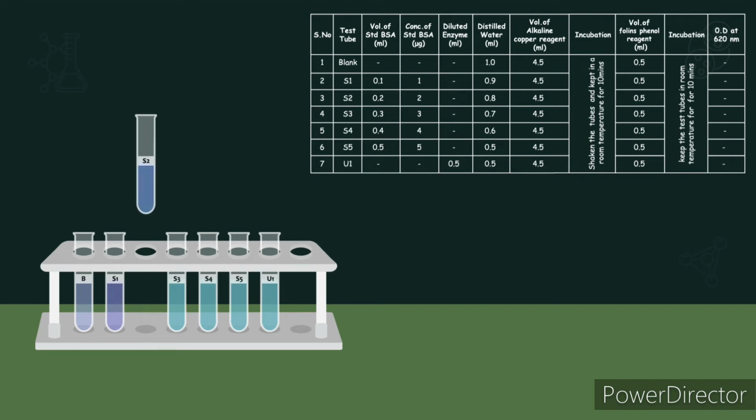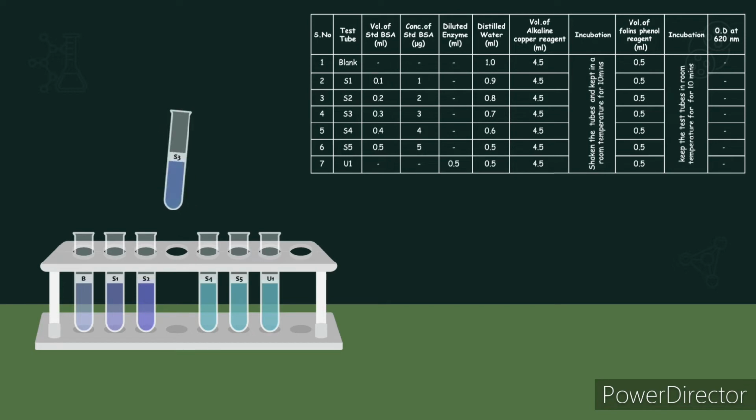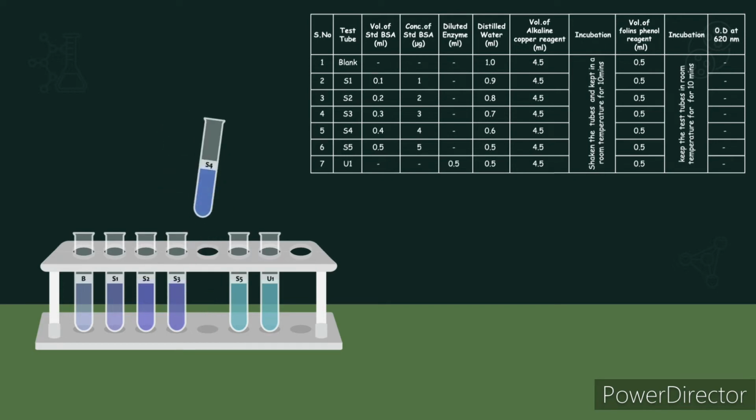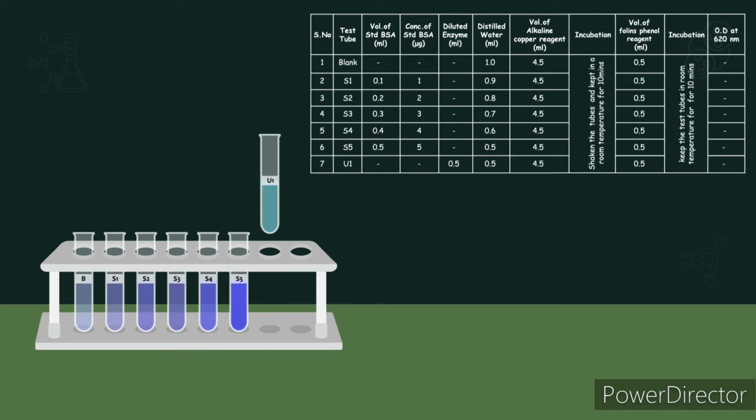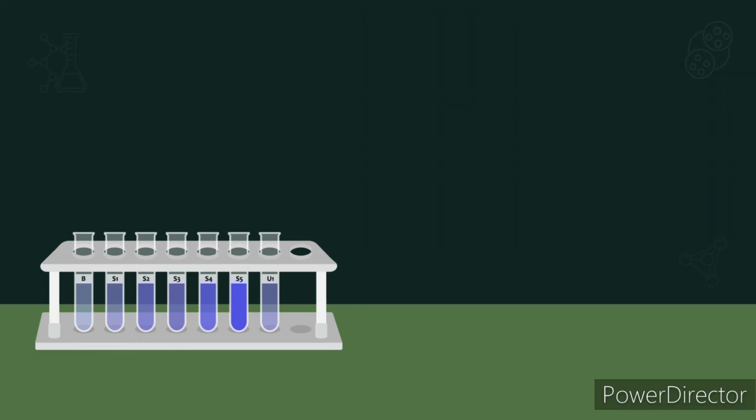So when we look at the video here, we are estimating the formation of blue color for estimation of proteins as per Lowry's method.